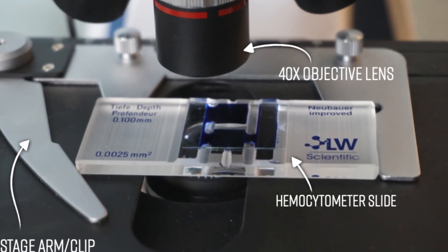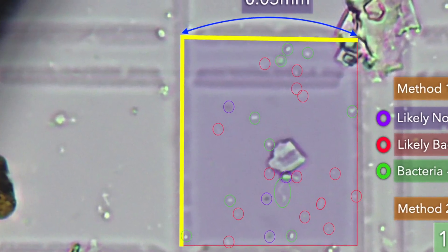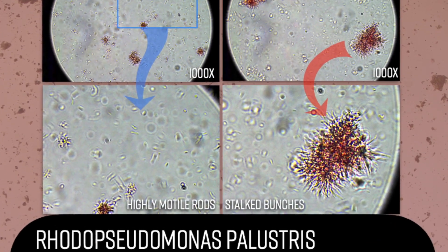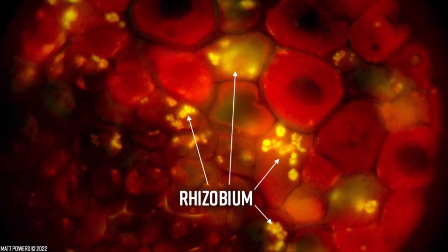And it's also a how-to — how to operate the microscope, how to do stains, the recipes, the directions, the step-by-step — that's all in there. But not only that, there's a morphological guide so you can compare what you're seeing against proven lab-certified samples.